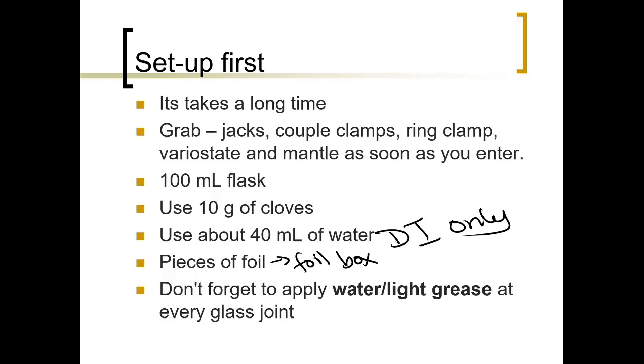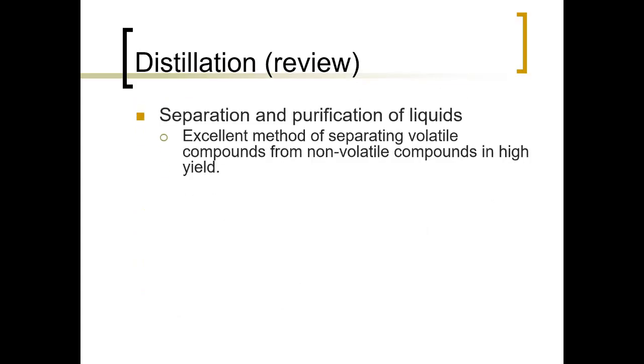For each of your joints, please make sure that they're either lightly greased or you put a little water in the joints so that they don't freeze up. If they freeze up, you can't pull them apart, and you're going to be deducted points from the lab if you didn't follow instructions. So let's review a few things about distillation.